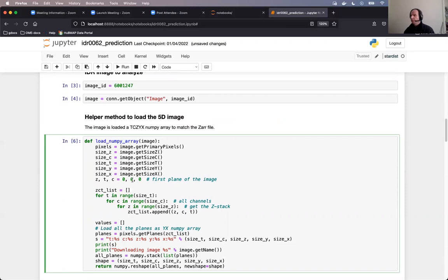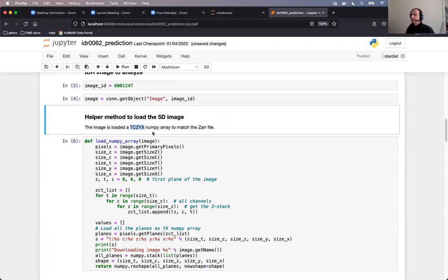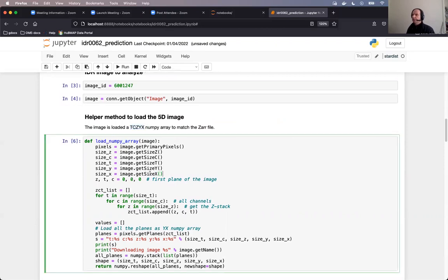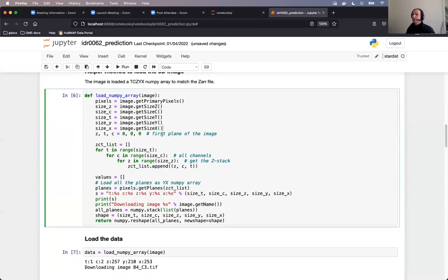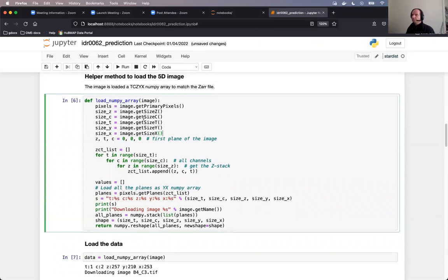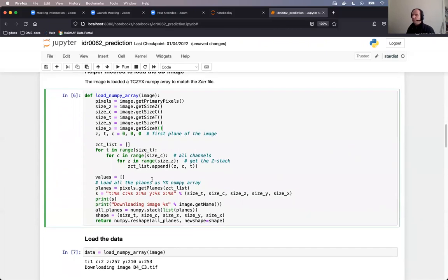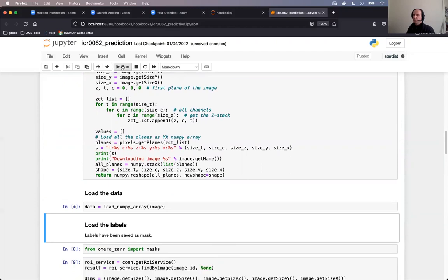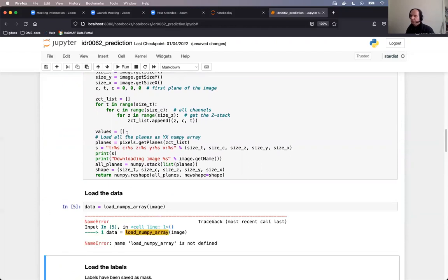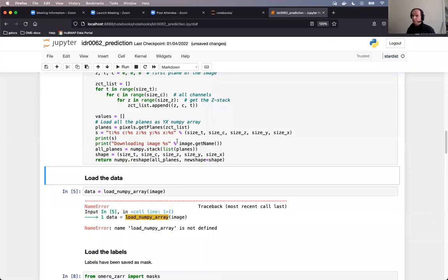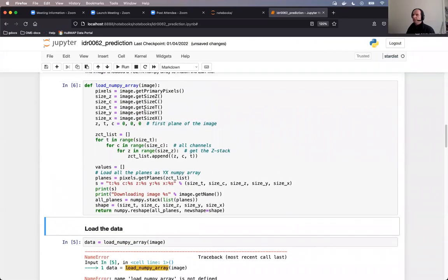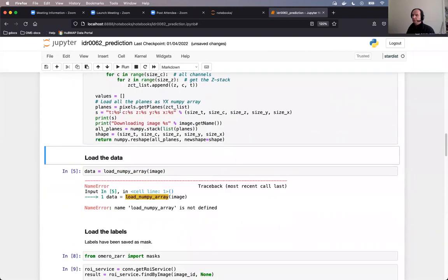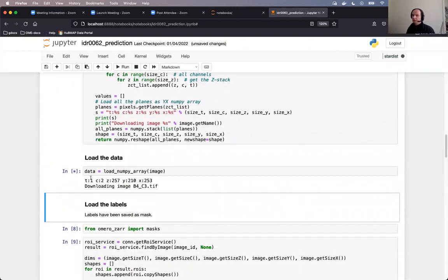So 5D image stands here for the three normal spatial dimensions, and then time and channels. And we will need this stack to be ordered in the order T, C, Z, Y, X, and this method is doing just that. So it is loading the NumPy array and reordering the planes as we need them. The loading itself is happening in the cell below. In the heat of the battle, I forgot to execute the definition of the method, which was of course a mistake. And now the loading is in progress.